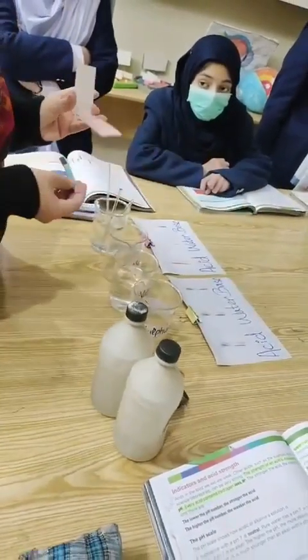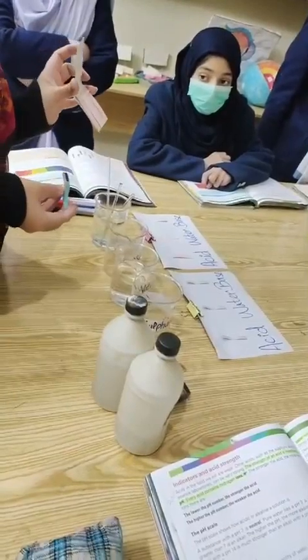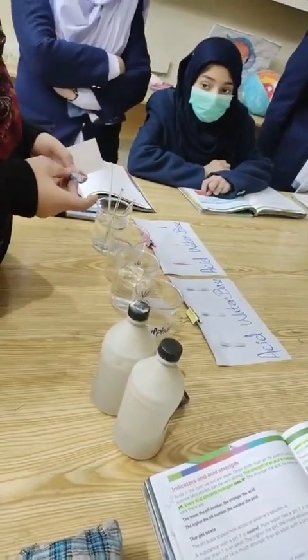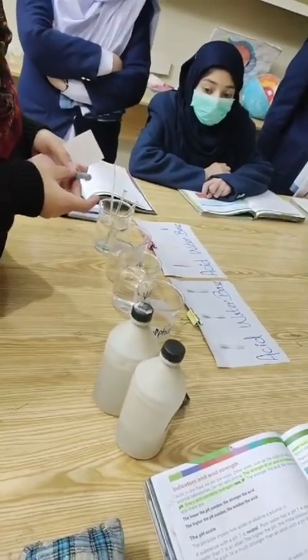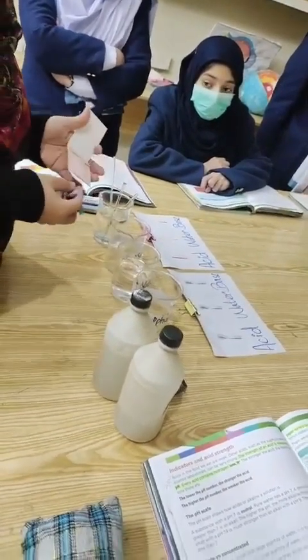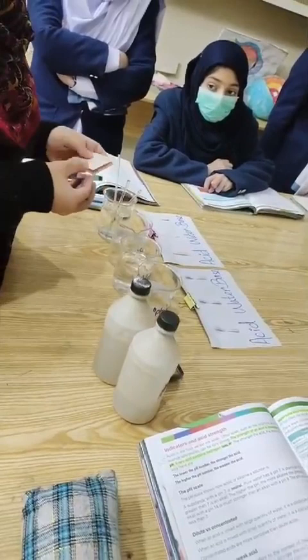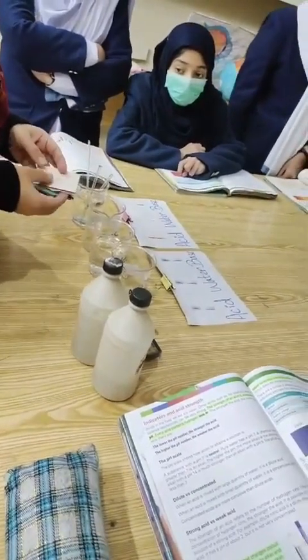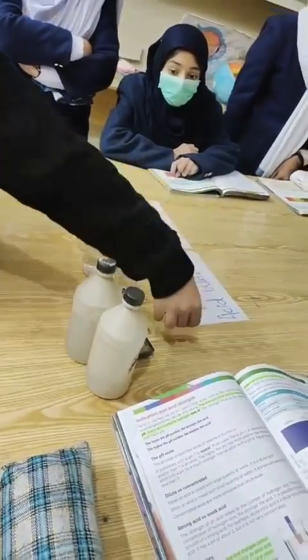We have red litmus paper and blue litmus paper. Fatima will explain how litmus paper reacts with acid, base, and water.